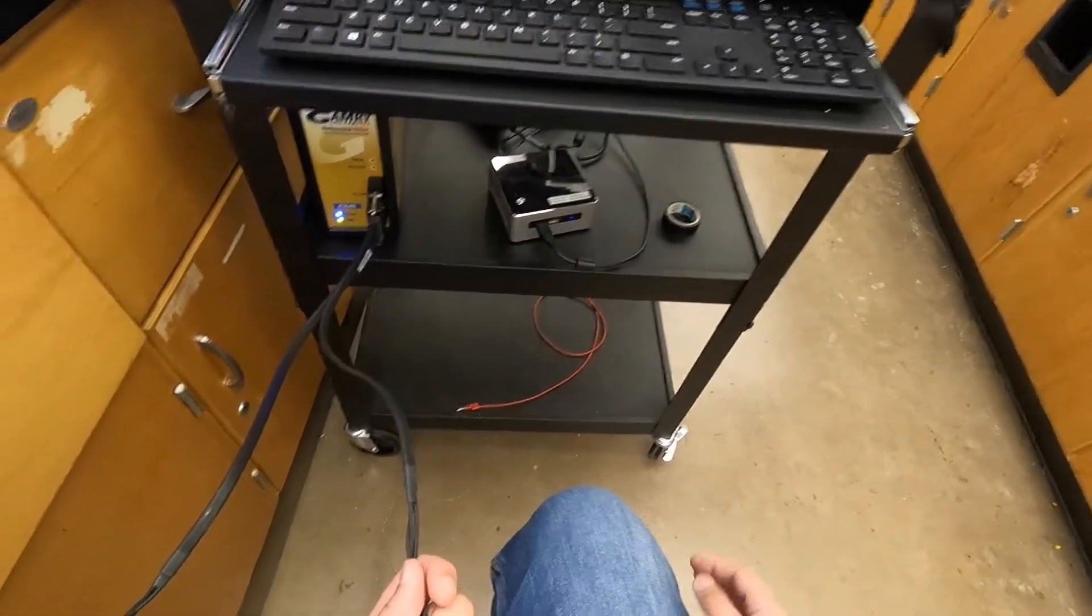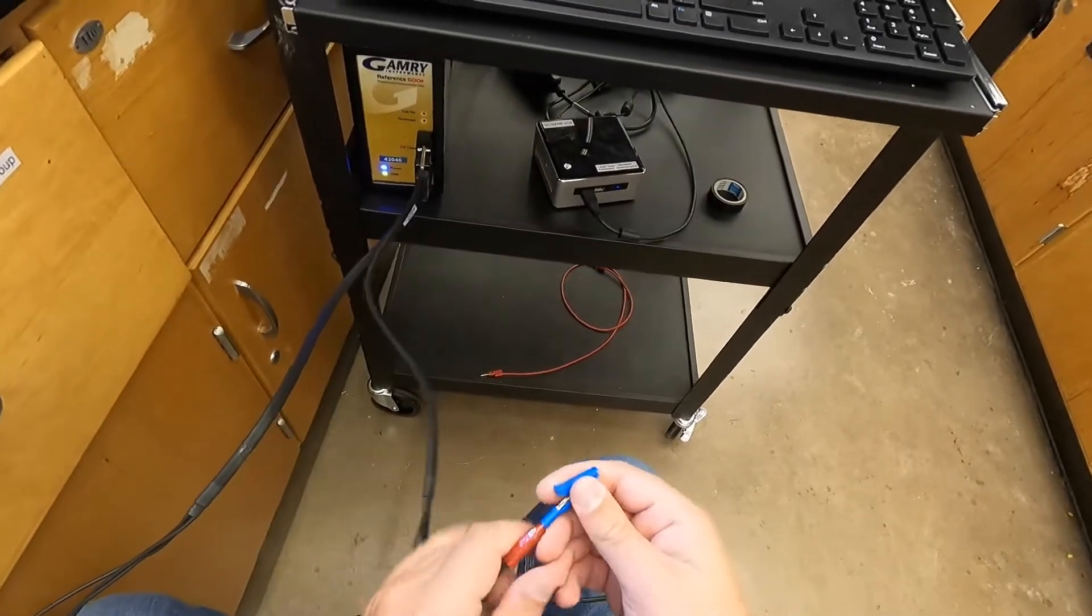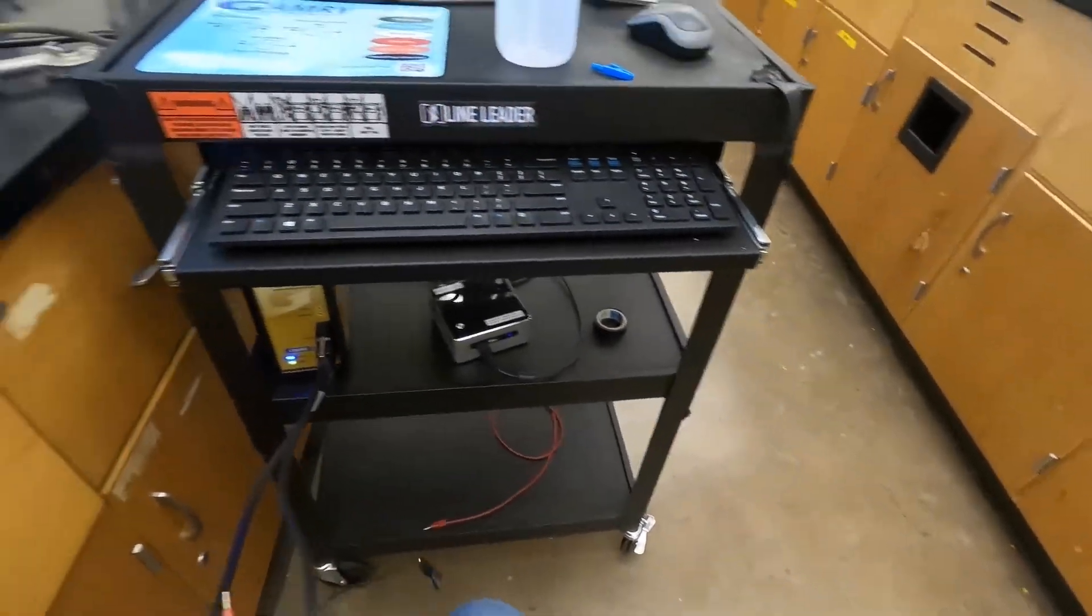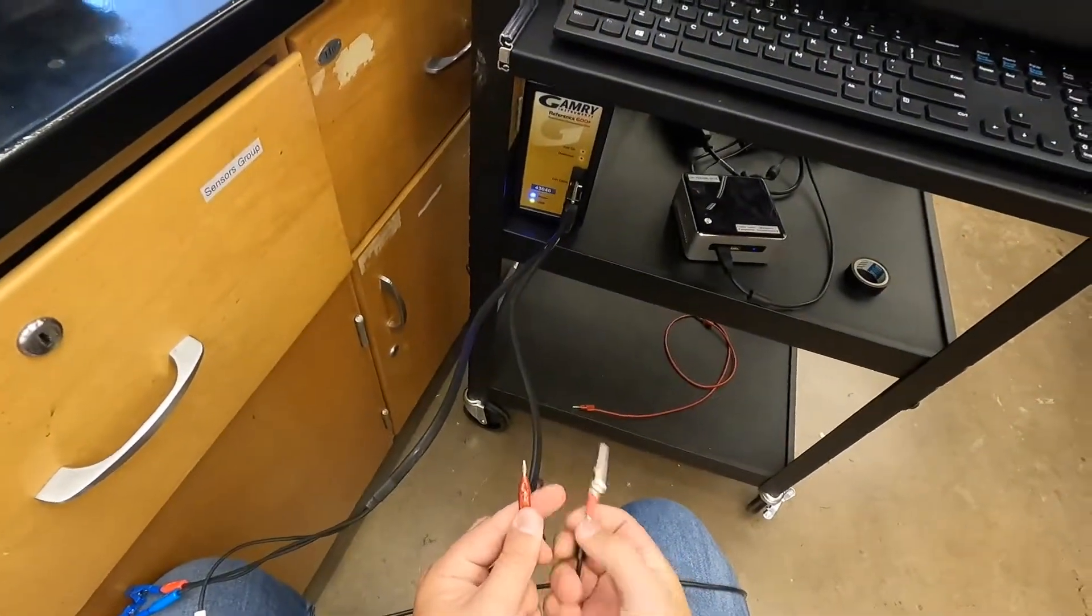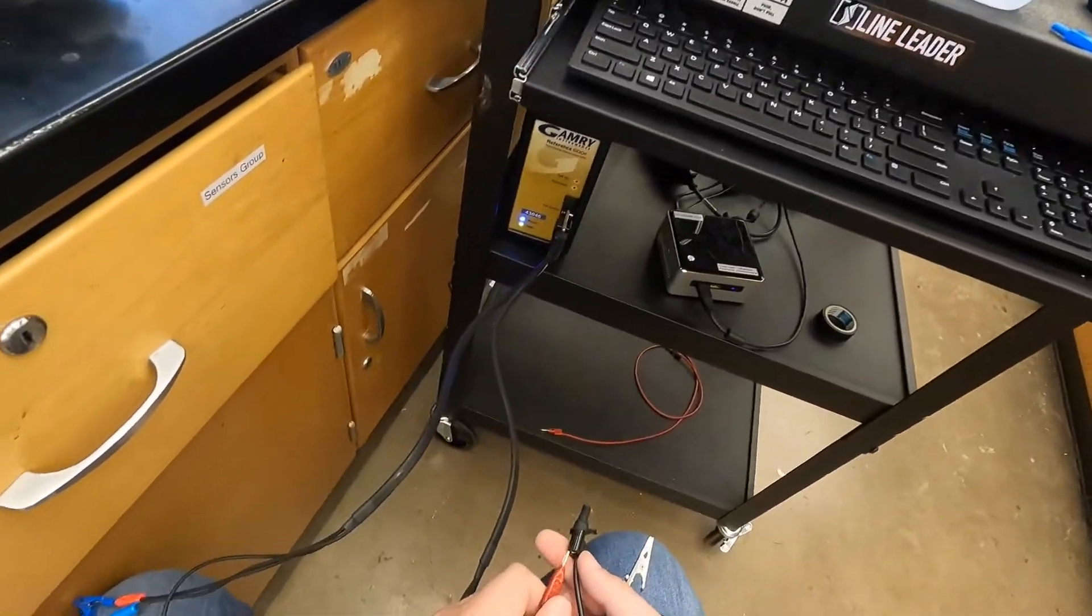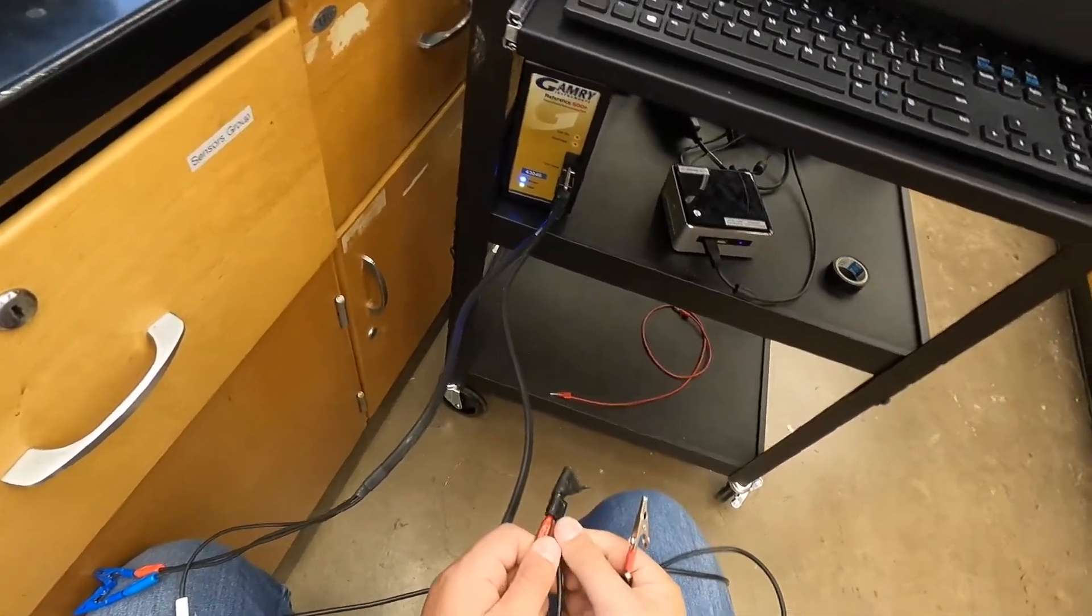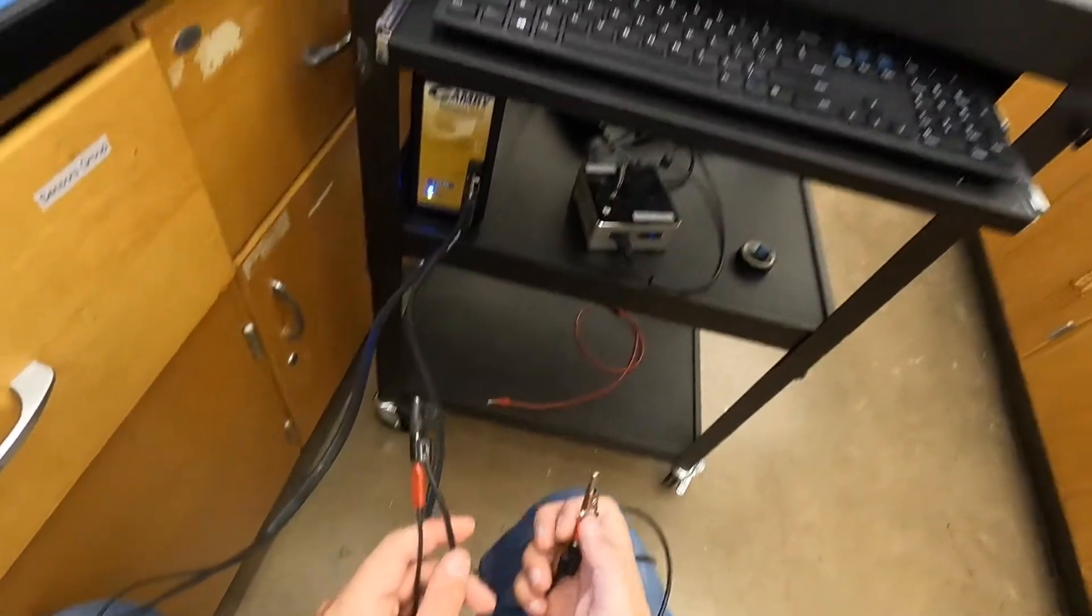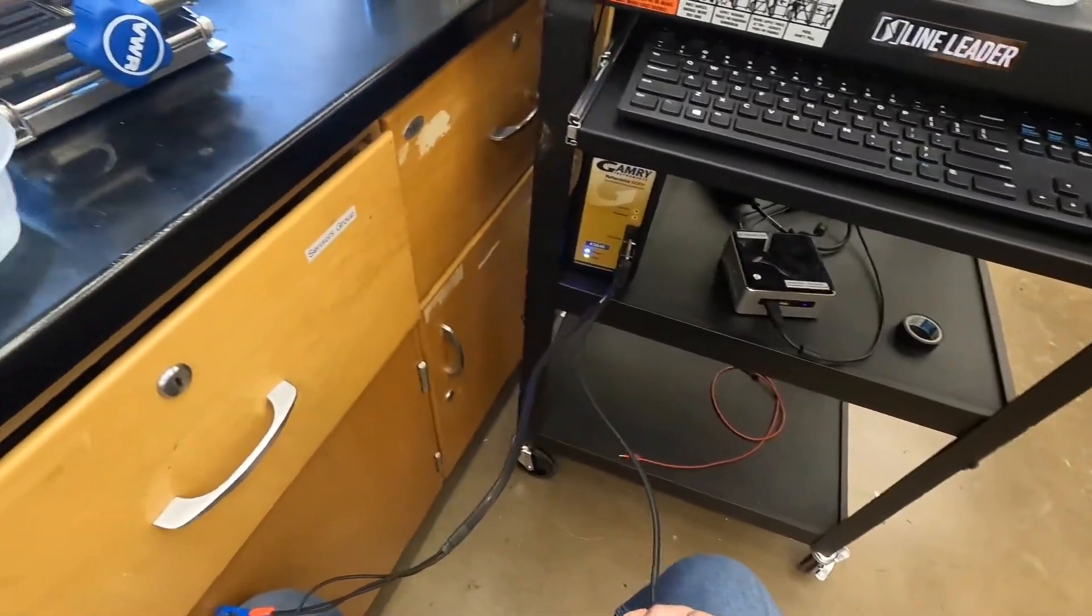Next we're going to hook up our counter electrode. Once again, just pull off the included alligator clip, take your extended line with the red heat shrink on the end and plug in that mini banana connector. You can find adapters in the Gamry tools.